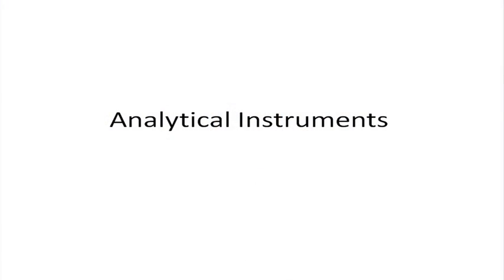Okay, so welcome back to the second module of week 3. We have been looking at the instruments, the analytical methods, the calibration curve, and how the data is collected. In this particular segment, we will be looking at some of the instruments that are used to generate this data. Let's start reviewing them one by one.